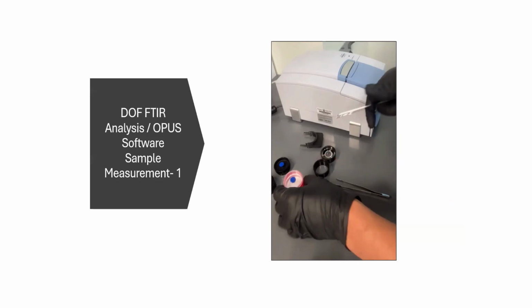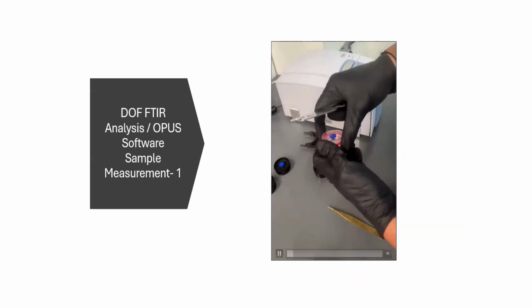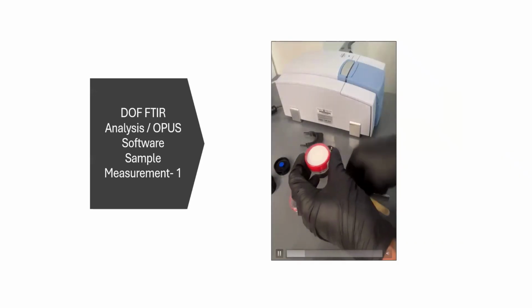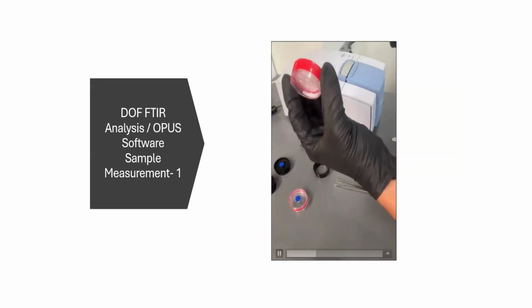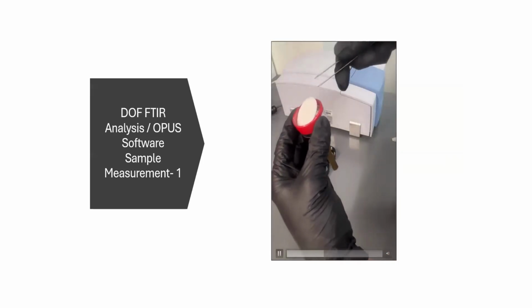After we have only a bottom compartment of the 3 pieces cassette in our hand, we take our actual dust sample filter. So you open the top pieces out, and you can use a sharp edge tweezer through the outlet hole at the bottom of the sample cassette and push gently from the cellulose pad just to give the filter a bit height.